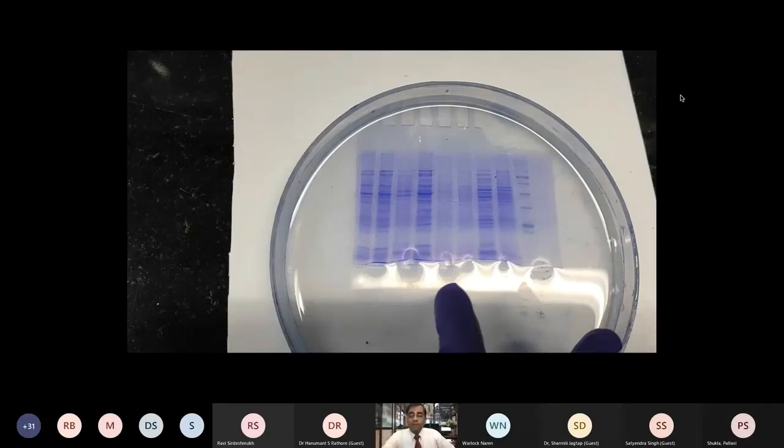I think in the sample preparation part, if you have a lot of patience and you can keep taking the backward step a couple of times, you will do good justice to your projects and to yourself for doing good proteomics work, because the more time and effort you put in for this step, the better prepared you'll be with your samples for the downstream analysis part. So this is one of the ways I think you should be looking at your gels.